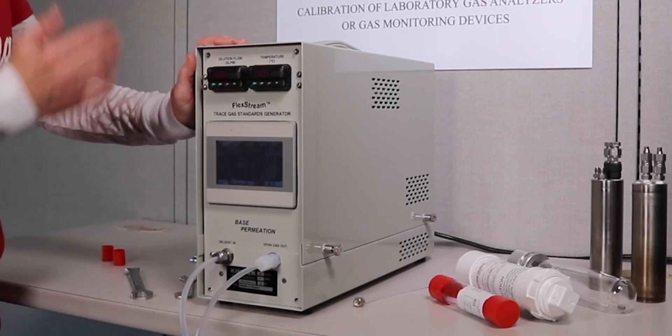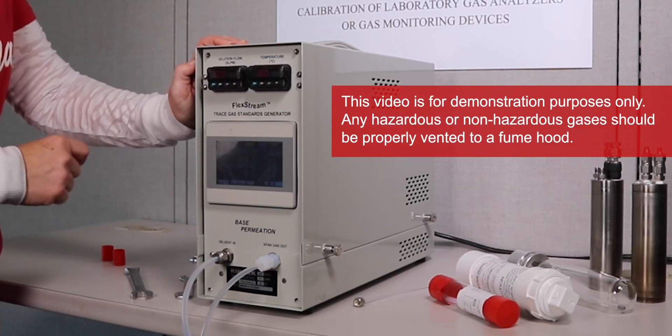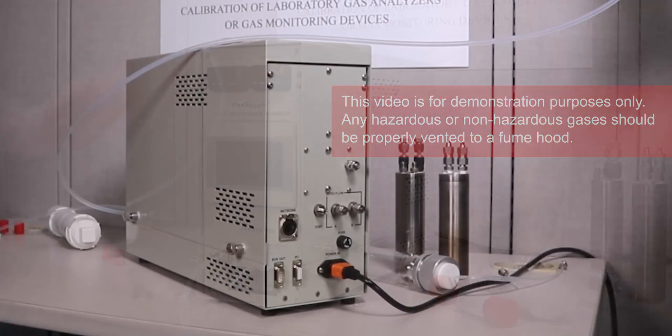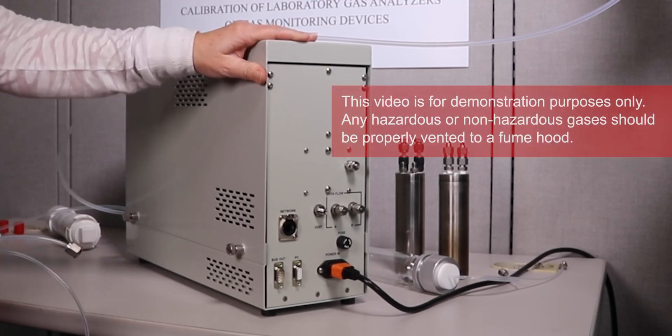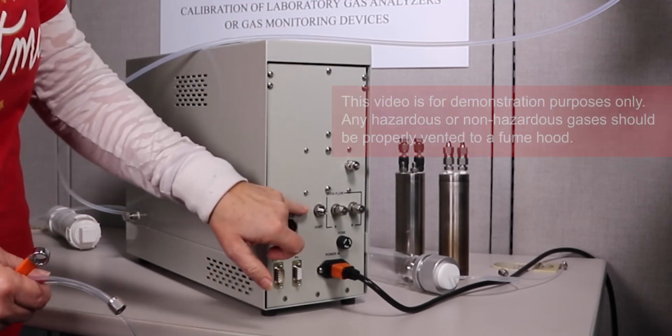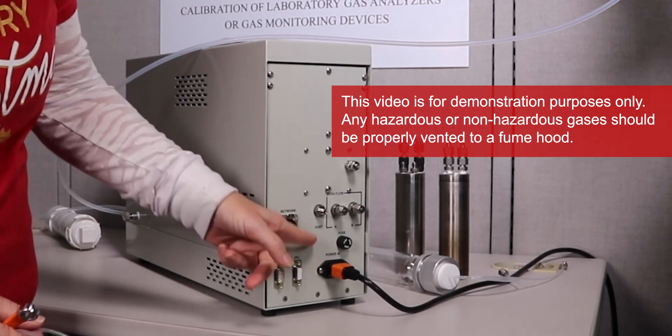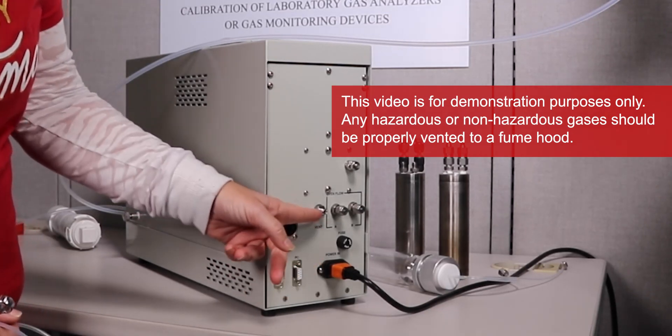I also have a vent line in the back that I want to connect that uses eighth inch tubing. Here we have the back of the FlexStream base module gas standard generator and as you can see we have a vent out port. It's an eighth inch fitting.